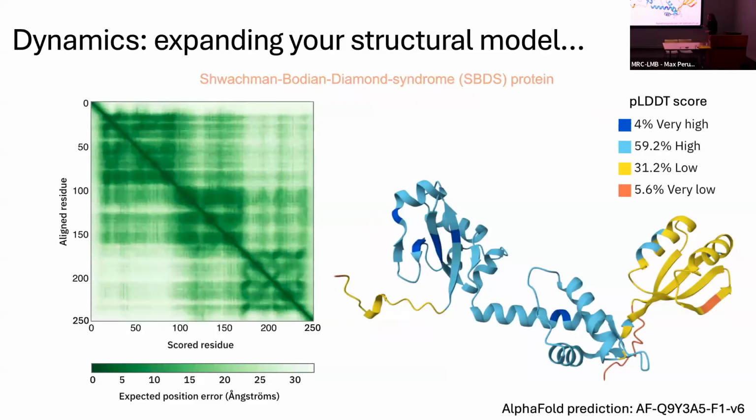So Dom spoke about AlphaFold, and I think it's such a useful thing to do. Do an AlphaFold structure instead of doing an NMR structure. Why not? It's very accurate. One thing when it comes to proteins with multiple domains, you can see in this 3-domain protein that's part of a ribosome maturation assembly, that AlphaFold says with some degree of confidence that the relative orientations of the 3 domains are almost this. They're not confidently the same, but there is some degree of relative orientation between them.